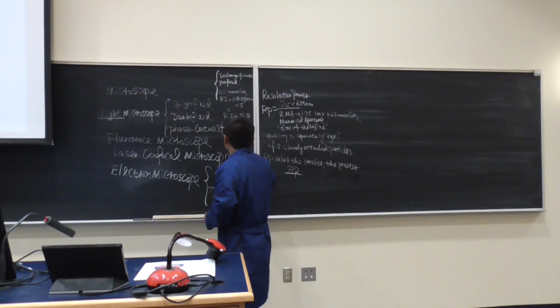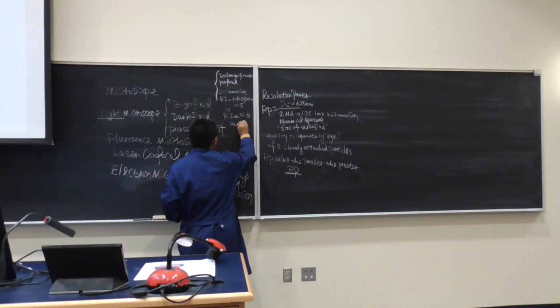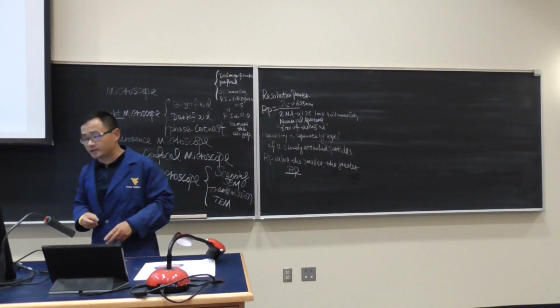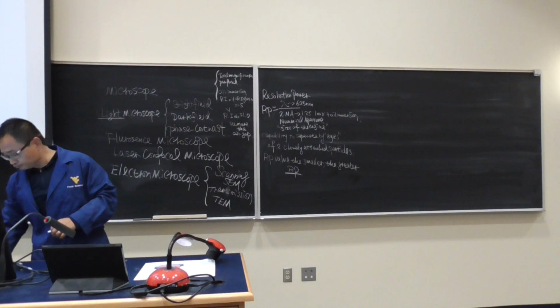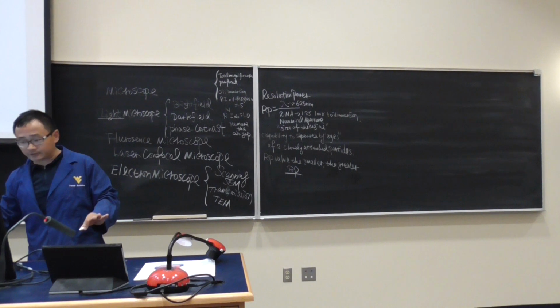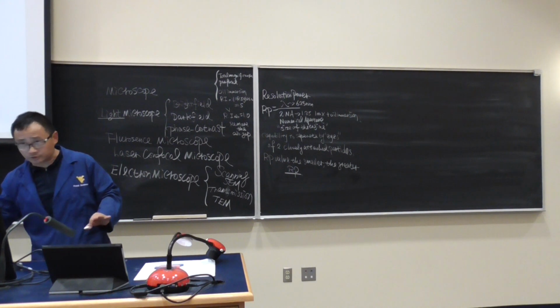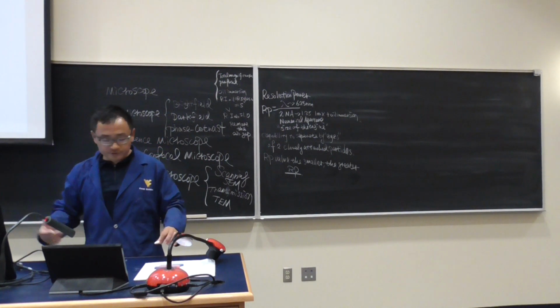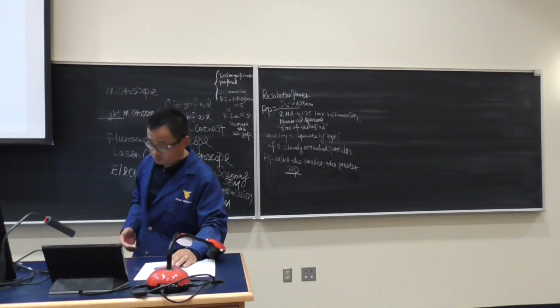Therefore, oil immersion is certainly to remove the air gap. We have already practiced in the lab twice how to use oil immersion. We'll practice again in the next 3 lab sections. So here we just skip it, and you can use these slides for review.